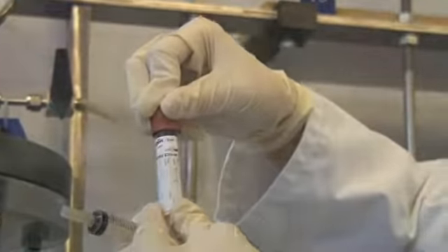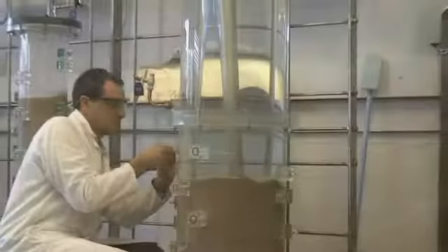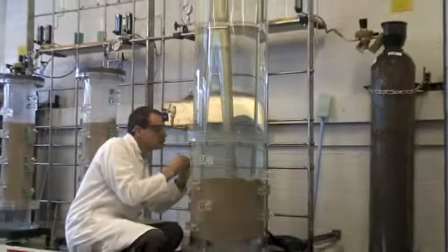We developed this laboratory experiment to study the impact of carbon dioxide on sediments and water. In particular, with the big column, we can study the formation of a gas bubble plume in the water. And from that, we can infer the impact of carbon dioxide, not only on dry environments, but even in submerged environments.